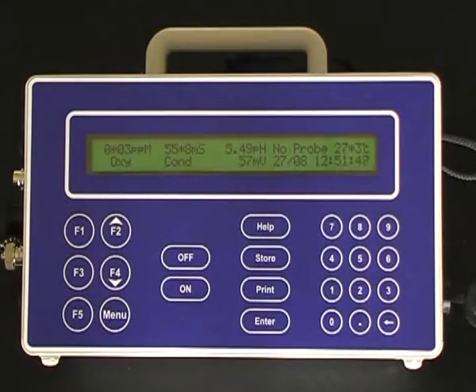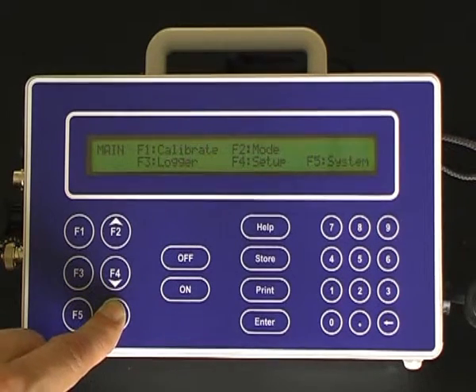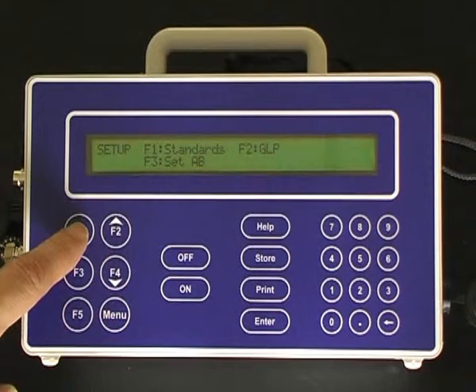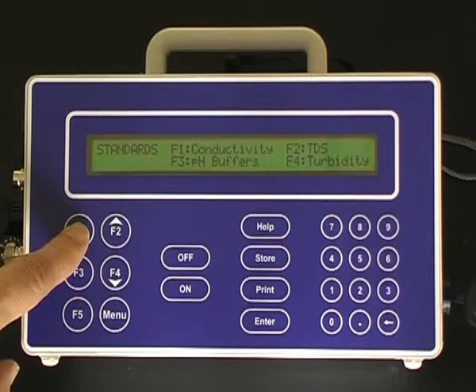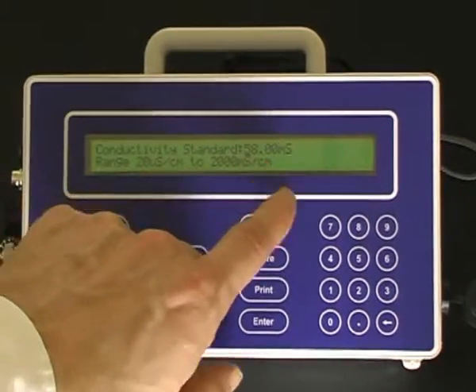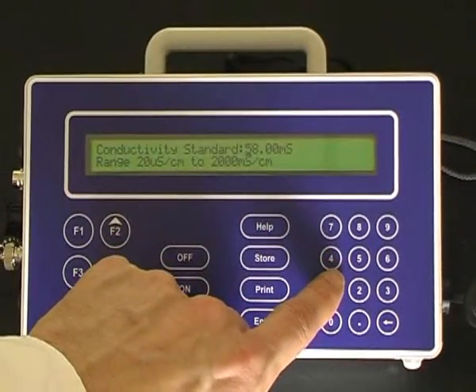Before calibrating conductivity sensors, you must first designate the concentration of the conductivity standard. Press Menu, press F4 for setup, press F1 for standards, press F1 for conductivity, and enter the conductivity value through the keypad.